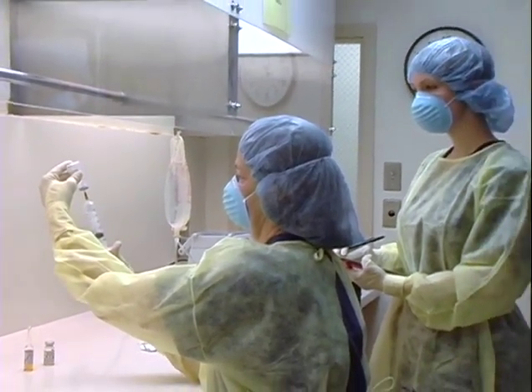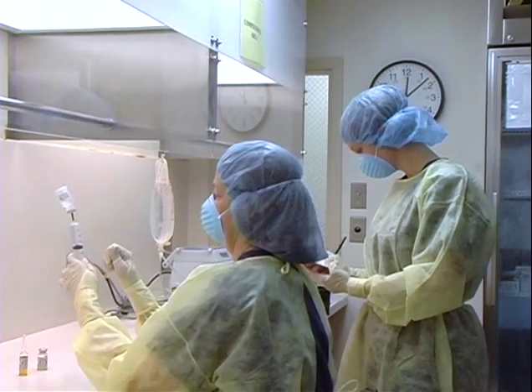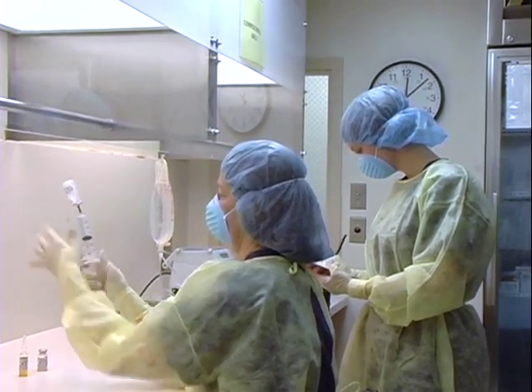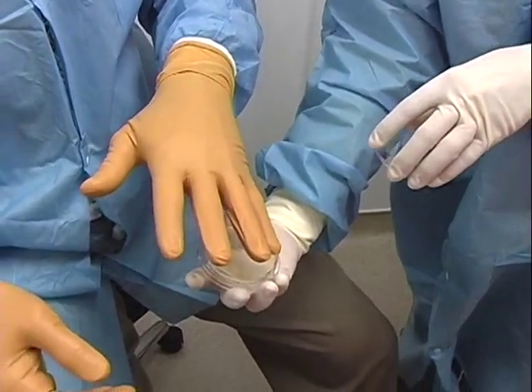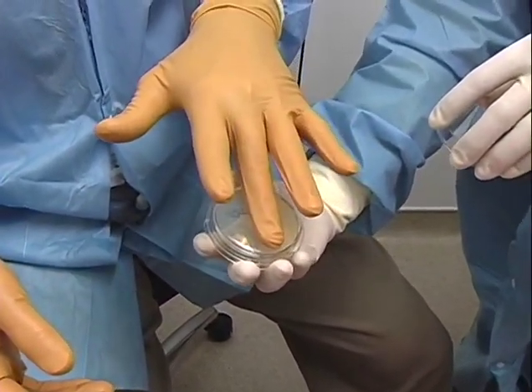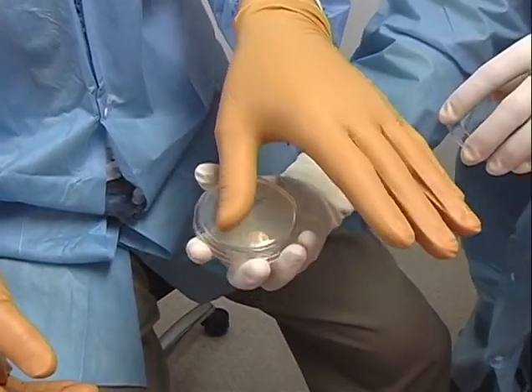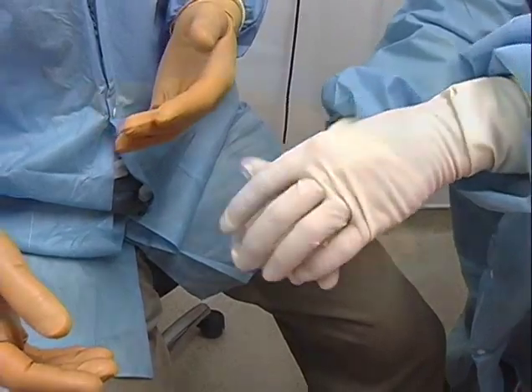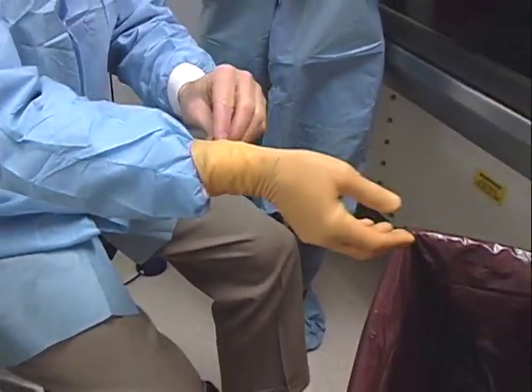In addition to direct observation of the complete verification exercise by the CSP supervisor or preceptor, the glove tips must also be tested for microbial contamination with a surface contact plate and must exhibit zero colony forming units, or CFUs, scientifically establishing the sterile gloving competency of the candidate. The gloves should be discarded and replaced after any glove fingertips are sampled.